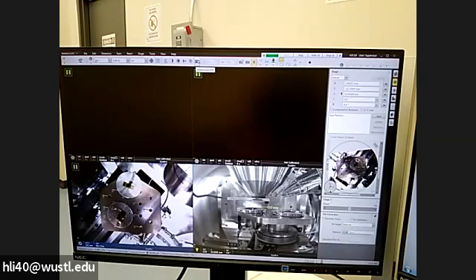Okay, so this is the contrast, also called video scope, to help you adjust contrast and brightness of the image. We will play with it later. The next thing is the dwell time per pixel. If we think about how SEM works, we actually shoot the electron beam on the sample point by point. At each point, the detector, we have different signal detectors, for example, secondary electron detector, backscatter detector, because when the electron beam shoots on the sample, it will interact with the sample and give you different signal counts.